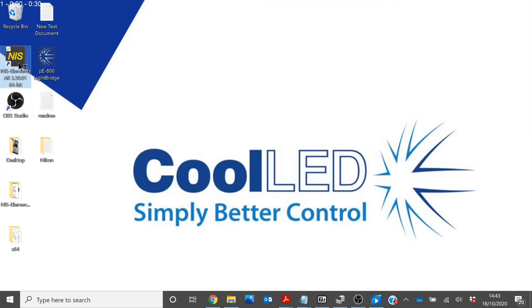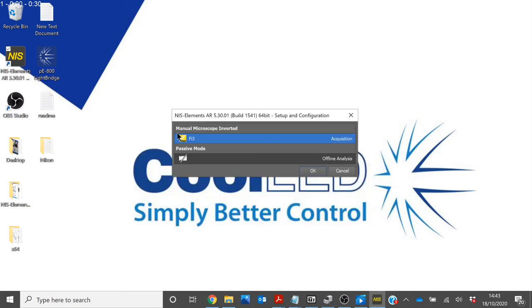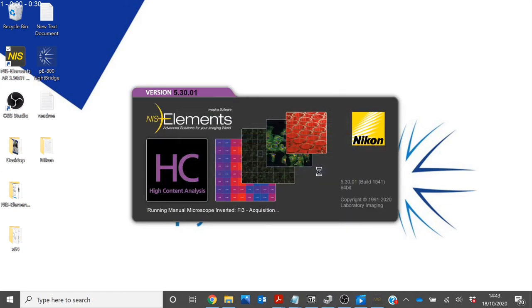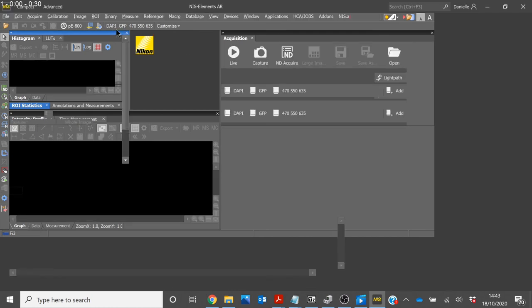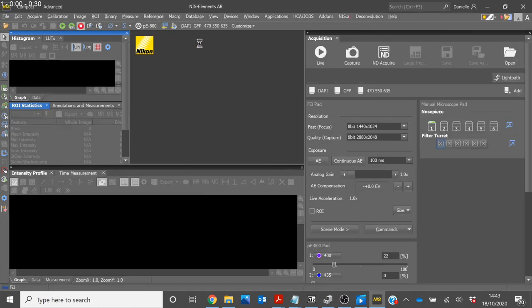When you reopen the software, your settings will automatically load. You can see this by your settings loading in the toolbar.